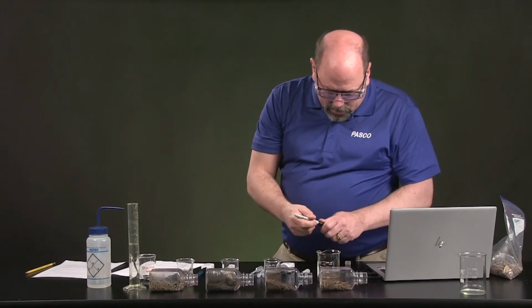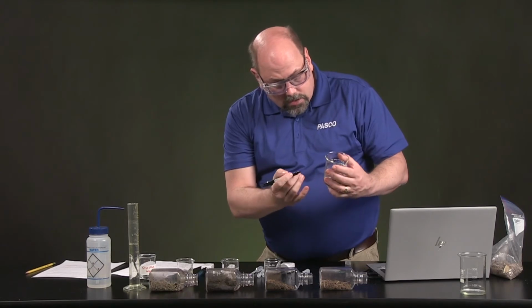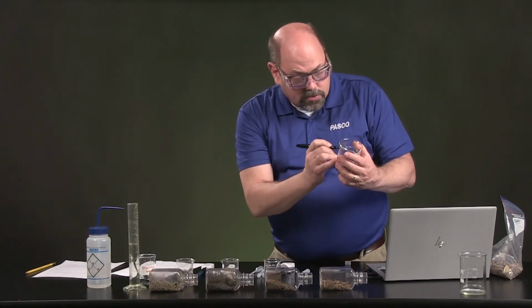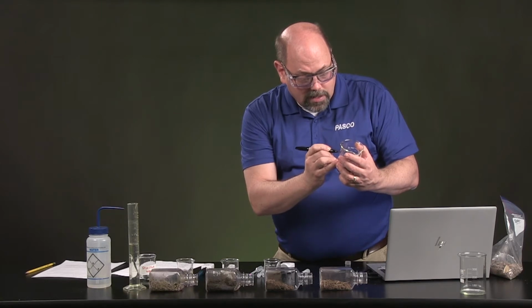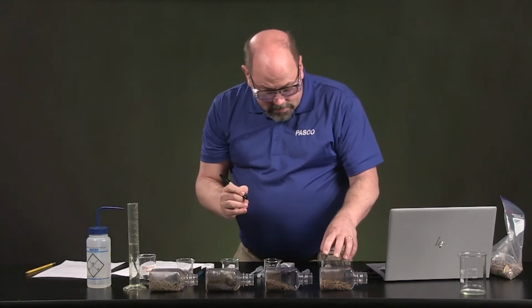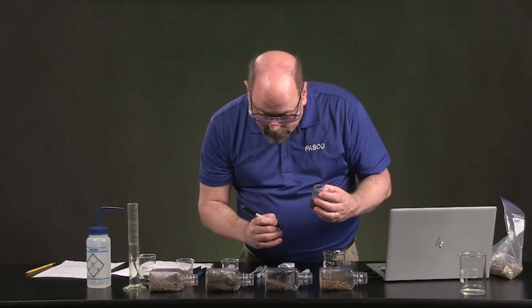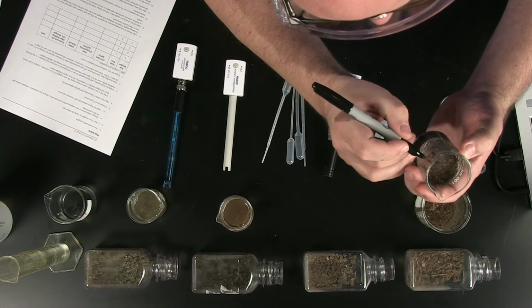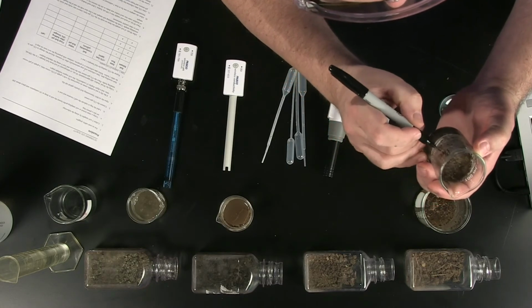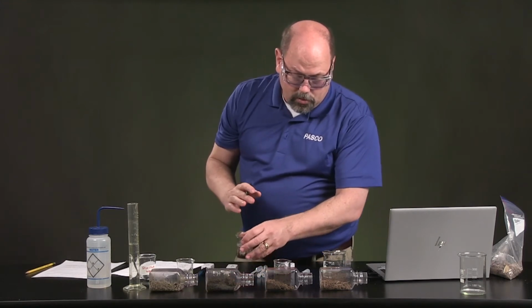So in each of these, I'm going to just jot a note right here on the beakers themselves. So this one, in terms of where our starting was, underneath the grass or the prairie, that's sample 1. Sample 2 was underneath the pine trees. So I'll put under pine or under woods, forest. That's sample 2.